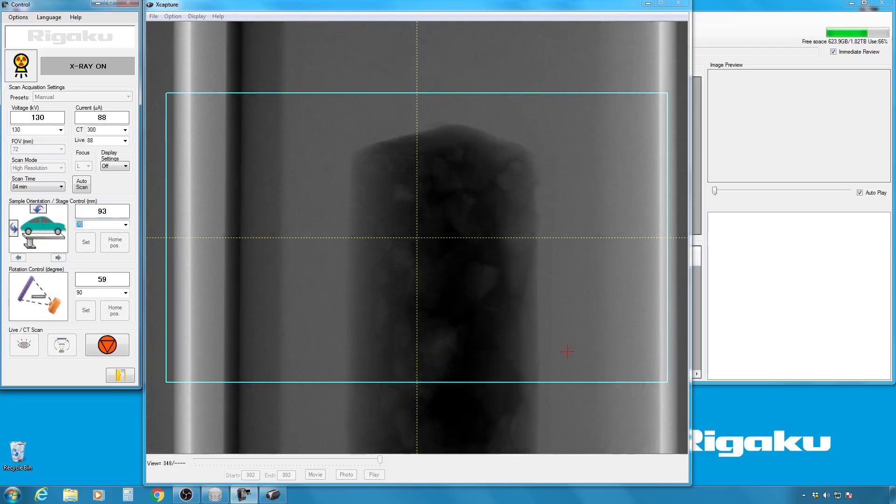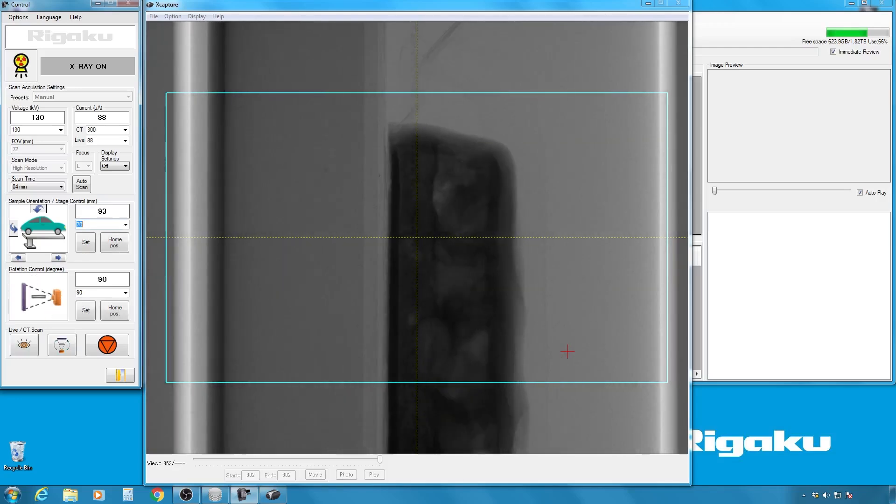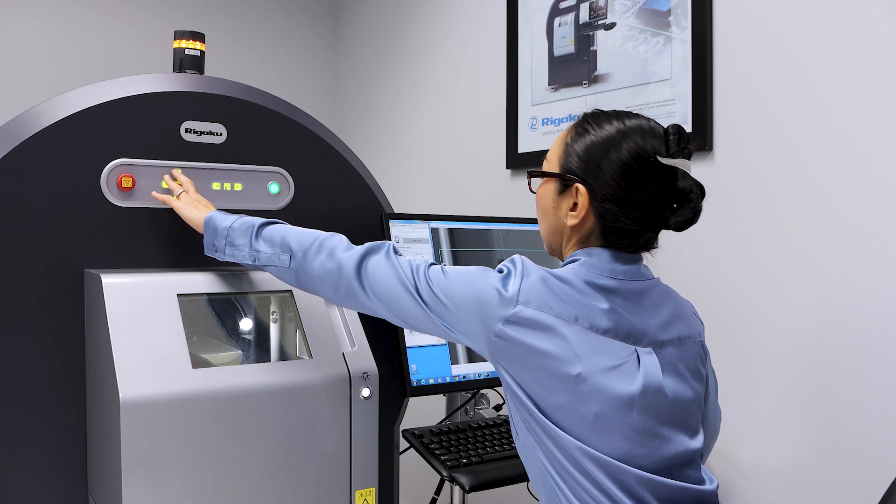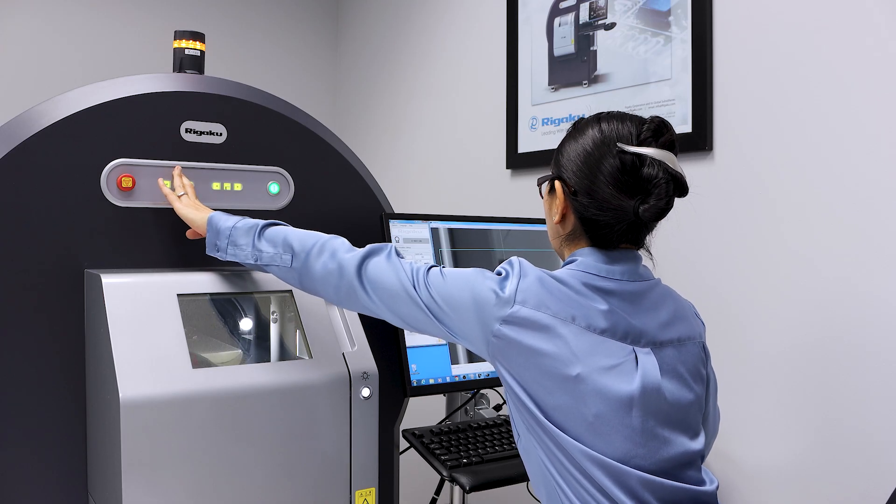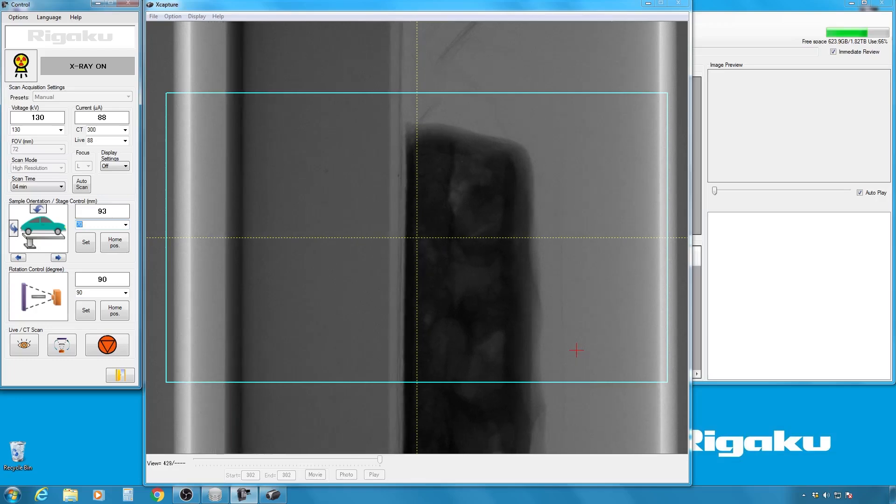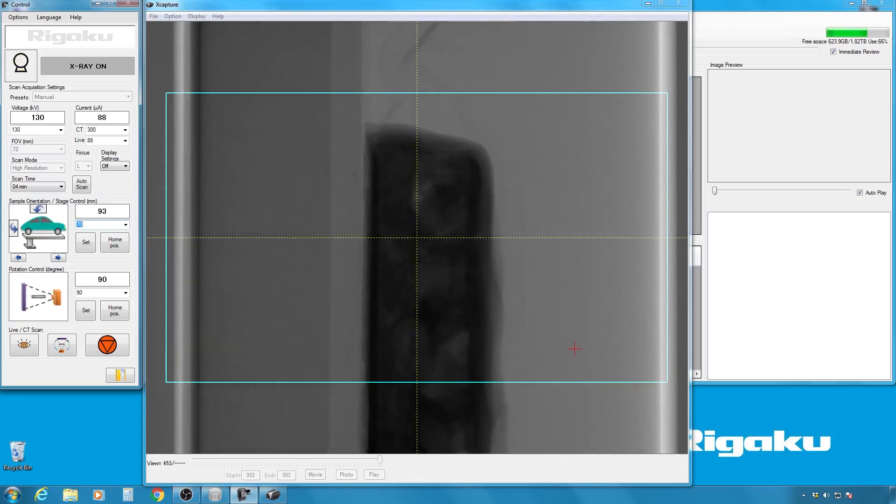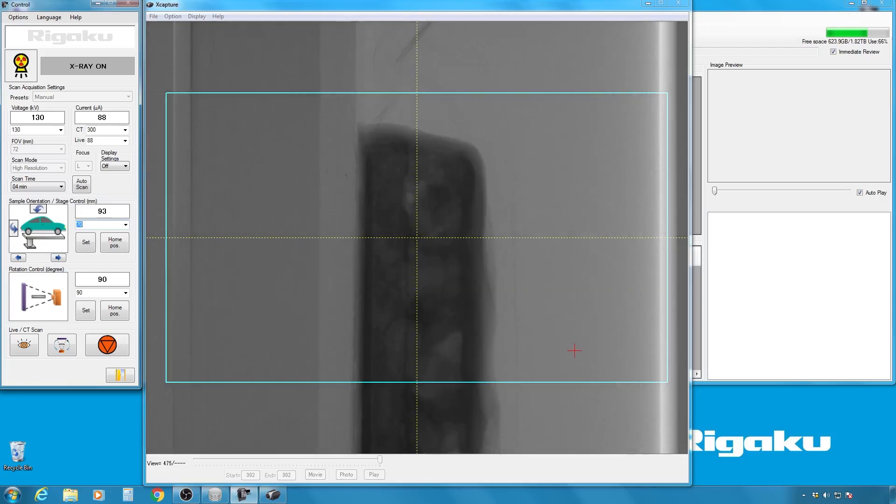So now we're looking at the sample from the side. It might look like the sample is rotating, but it's not. We're rotating the X-ray generator and the detector. So let me get the height right. So that looks about the center, okay?